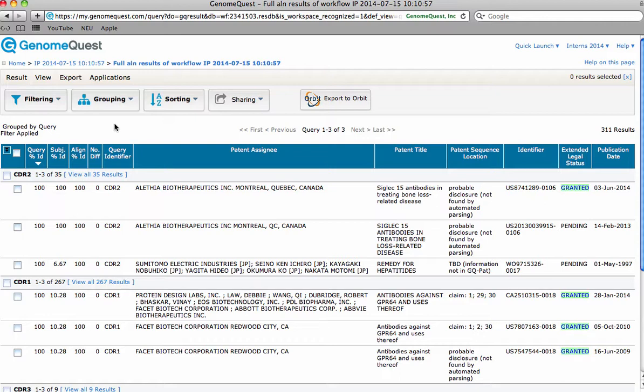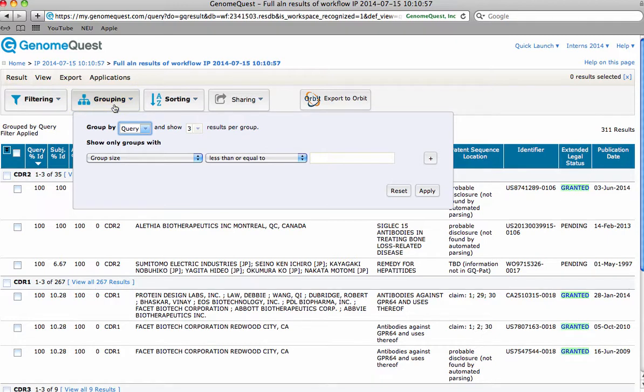To further organize your results, try the grouping option. Note that the grouping criteria respect any filter criteria set. No results are eliminated, only categorized.